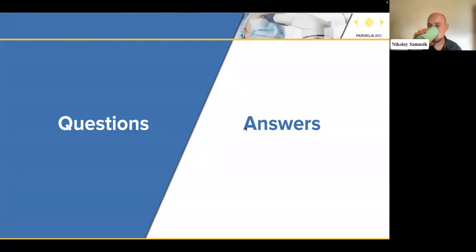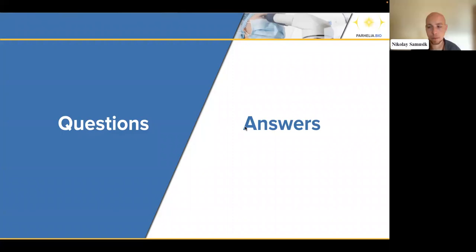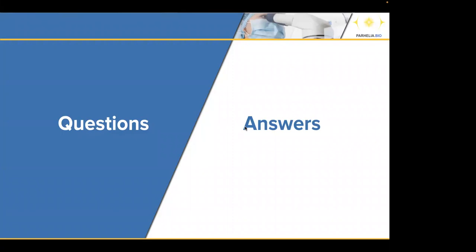Hi, Nikolay. Great presentation. Hey, yeah, good hearing you. Thank you. I was just wondering, through my use of your system, how do you correct for doing the CODEX staining when you have washing steps that require larger volumes of, for example, the washing staining solution, and now you're working in this minimal volume amount? How do you correct the reduction in volume? I understand the reduction for the antibody solution, but for those other types of solutions, if it only fits like 50 microliters inside a coverslip holder, how do you correct that during the staining process, when you're automating it?